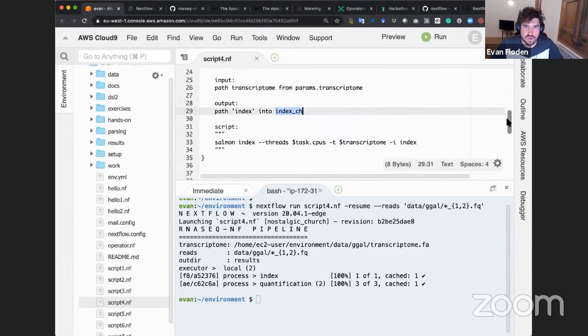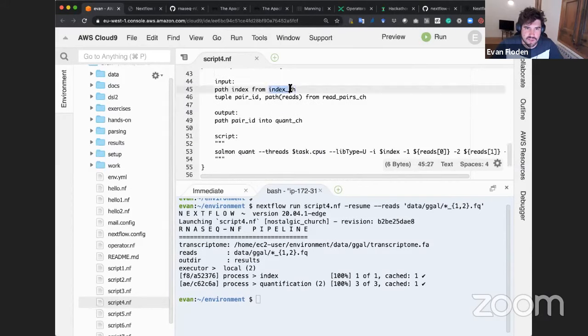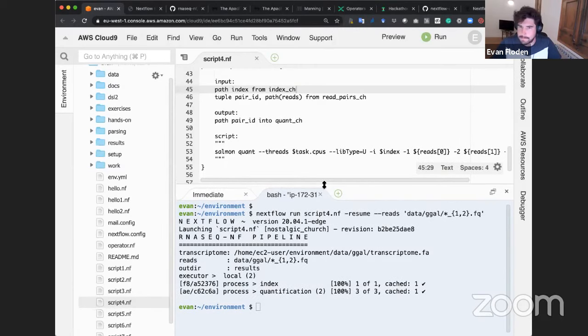This means that we can use it multiple times in here. So because this is a value channel, we can run the gut sample against it, we can run the liver sample against it, etc. So we don't need to create this channel beforehand with multiple elements like you may do, specifically because it's a value channel.